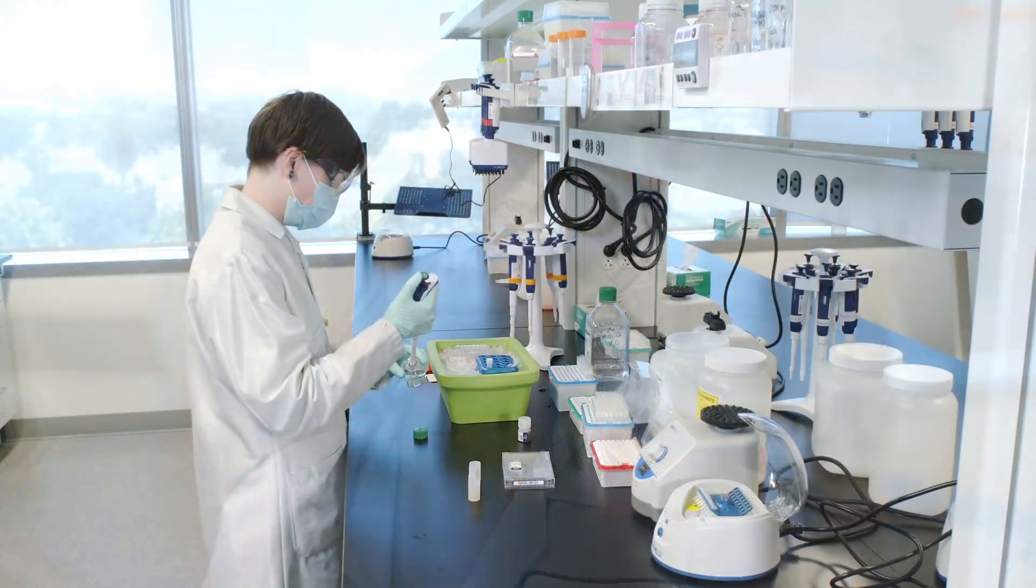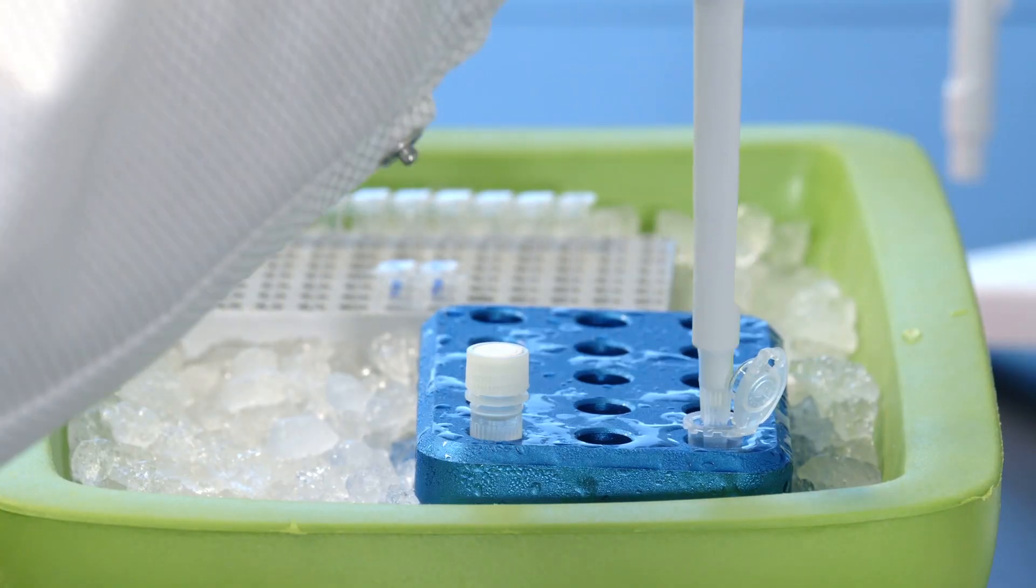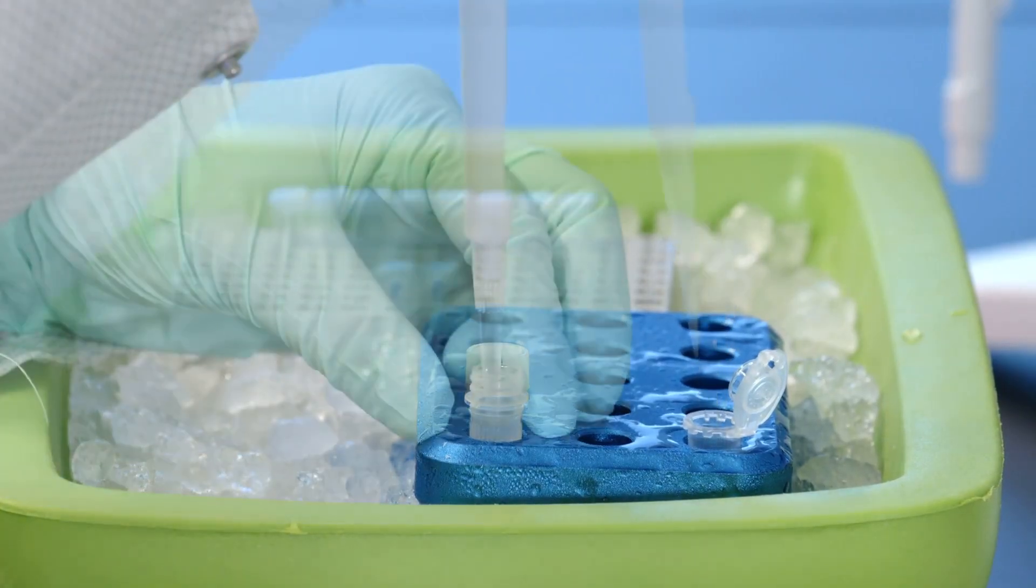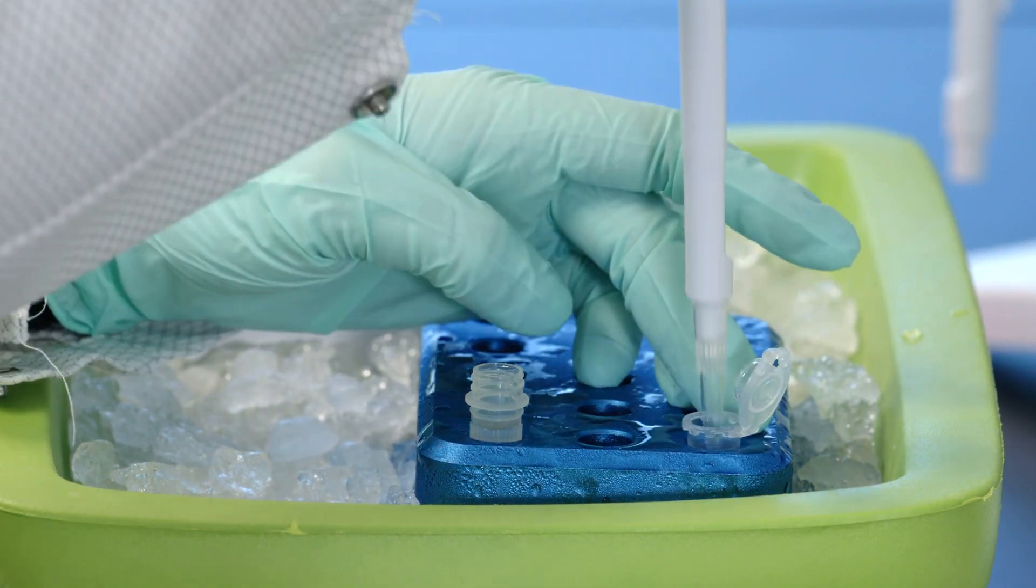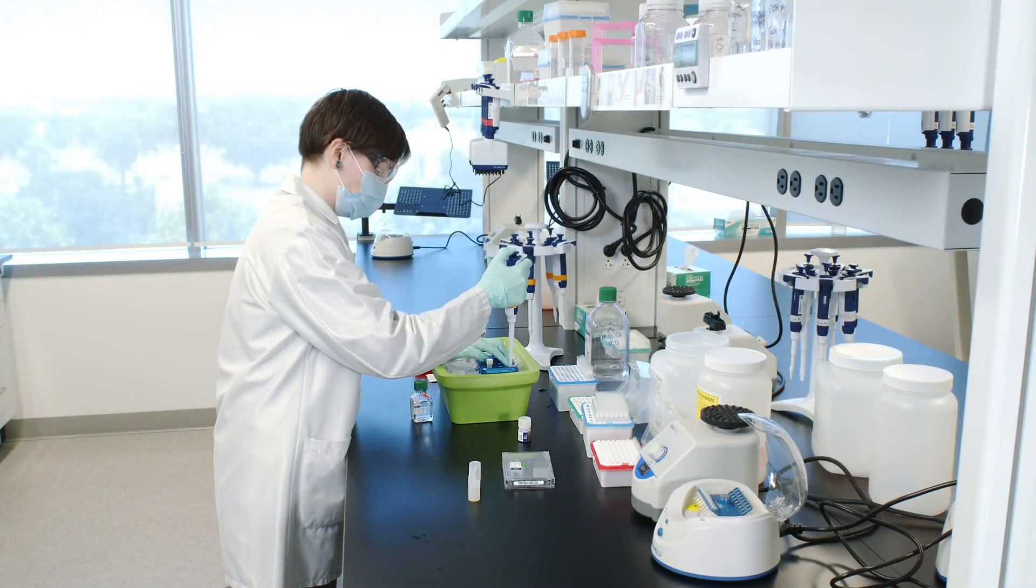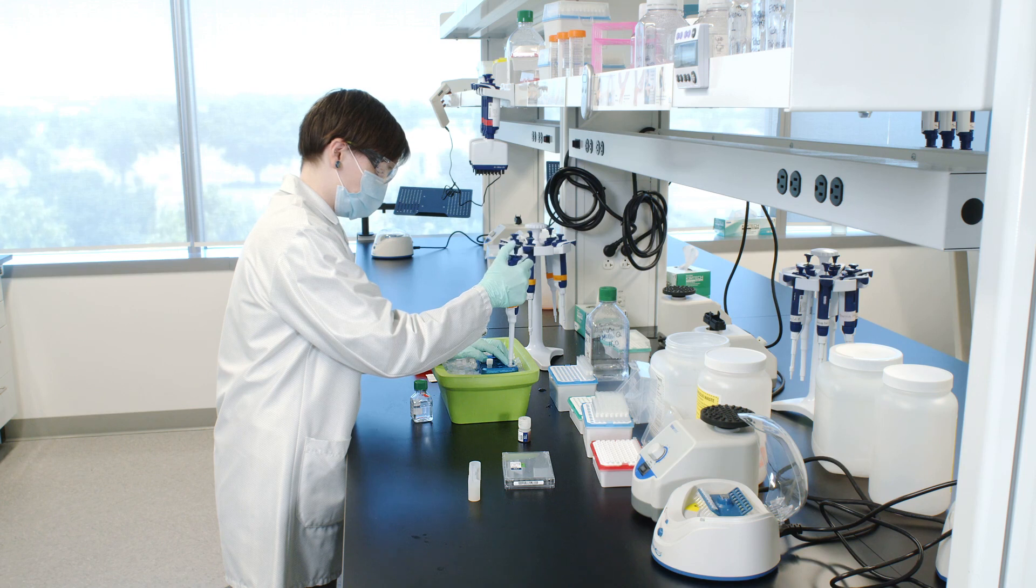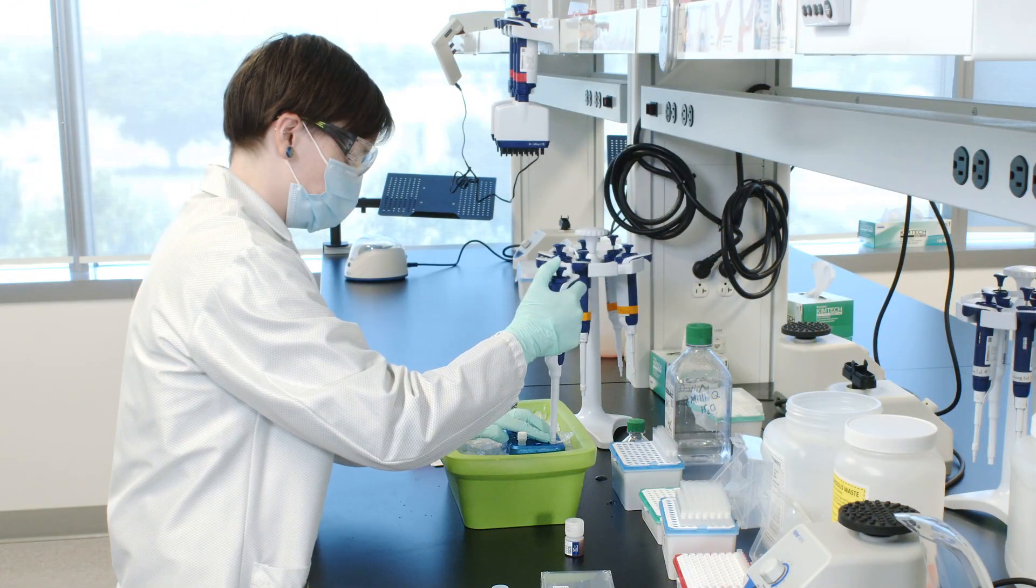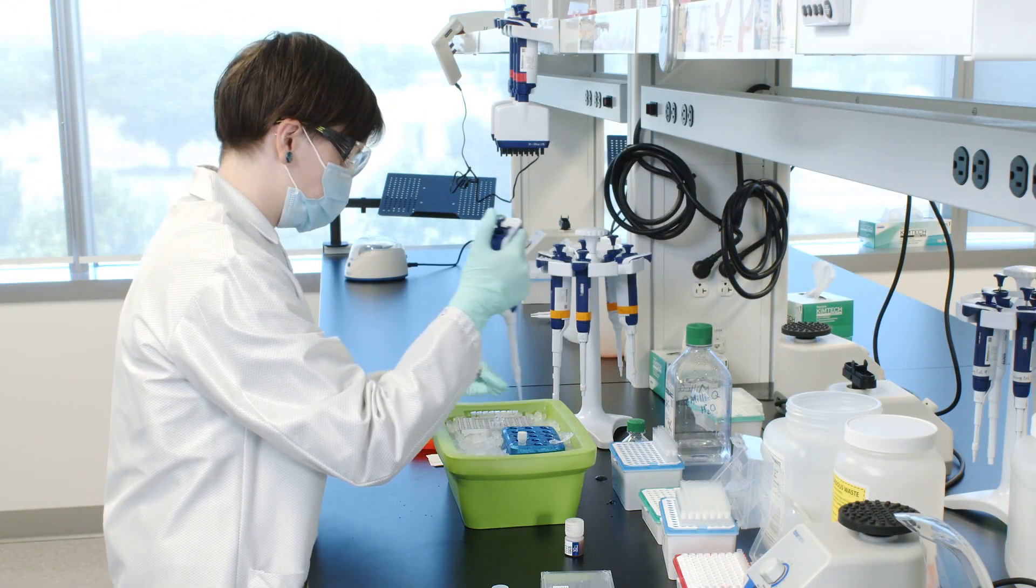Next, we will prepare the amplification master mix by combining nuclease-free water and Amp Mix B. Pipette mix 10 times shortly before use. Add 70 microliters of amplification master mix to a tube in an eight-tube strip for each sample.